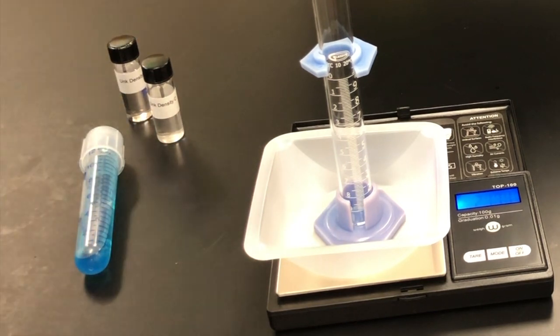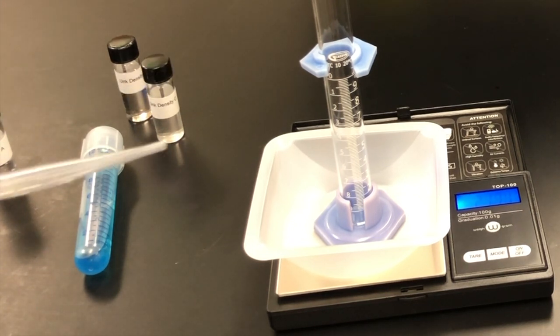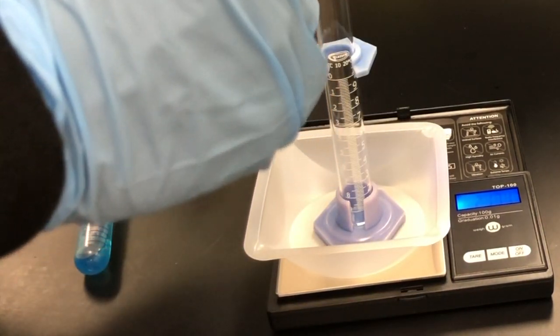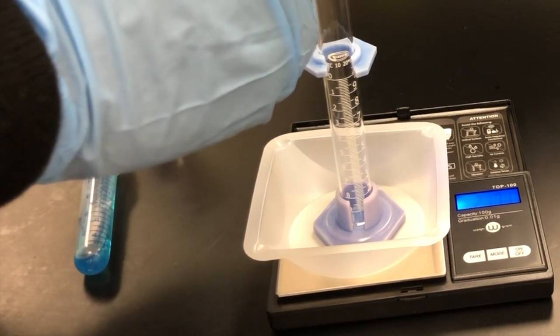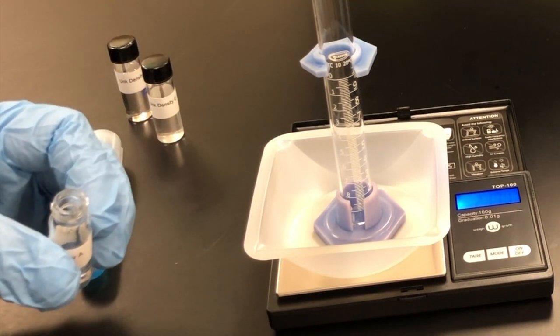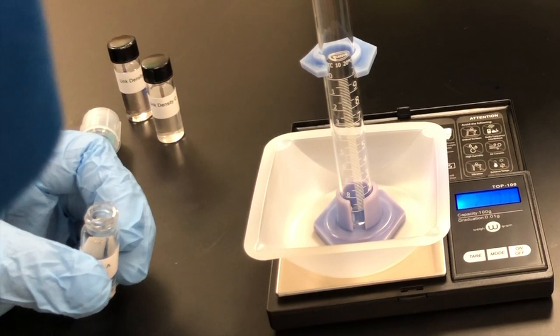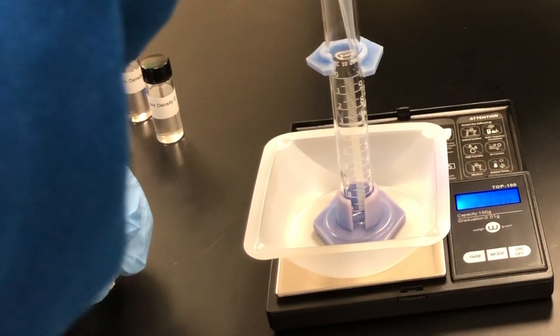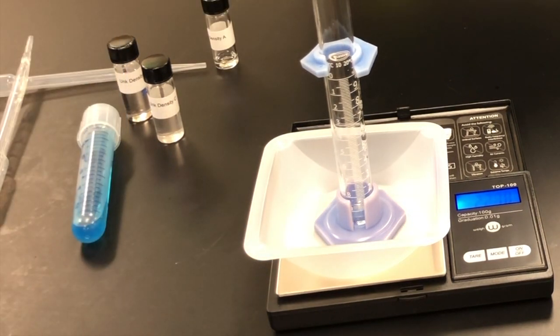Next thing I'm going to do is take liquid A, and add enough of the liquid into the graduated cylinder so that I can read the volume. So I'm just going to take my Beral pipette, draw some of the liquid out, and then carefully place it into the graduated cylinder. Make sure that you record the initial mass. So this particular mass now with the liquid inside is 22.18.